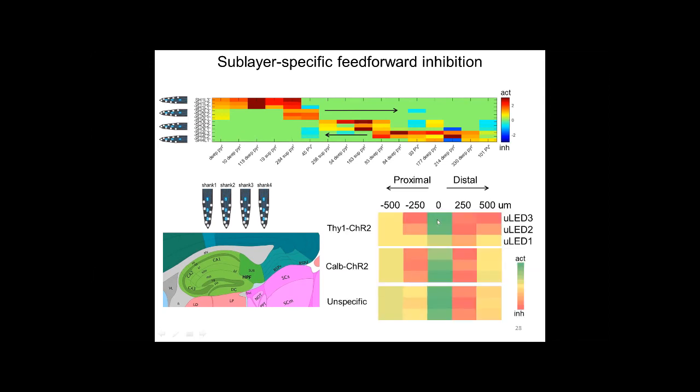Here in these matrices we have the responses. Activation is green, inhibition is red, as I showed before. For channel 0, we look at the mean response across all the channels when we shed light in number 3, 2, and 1. Here is a wrong number, no problem.